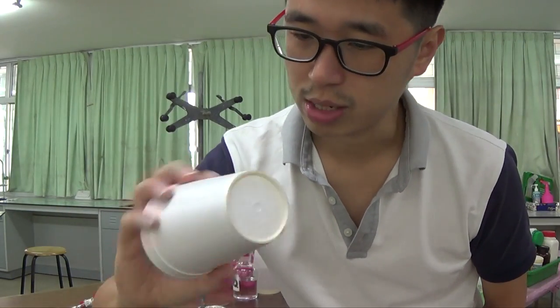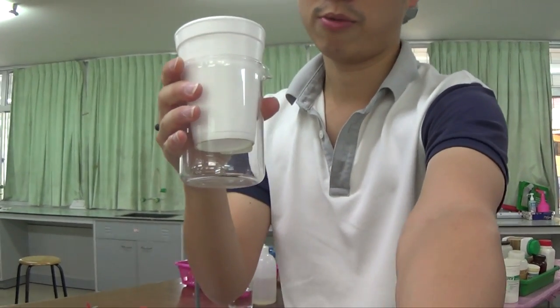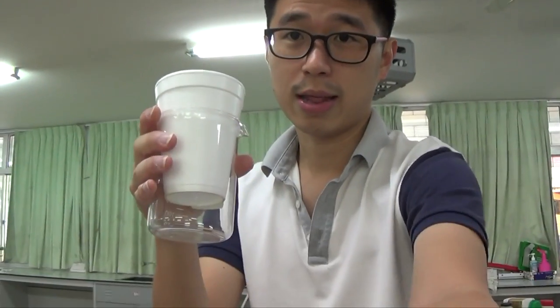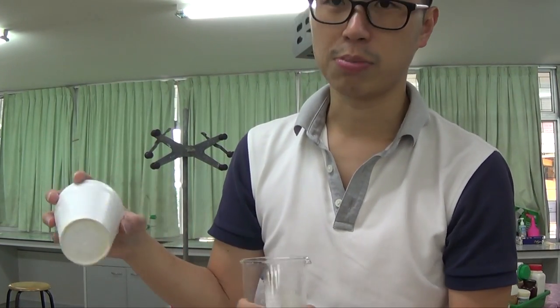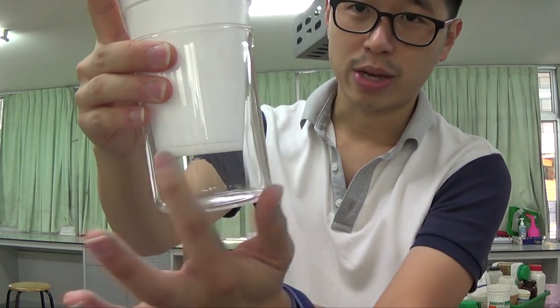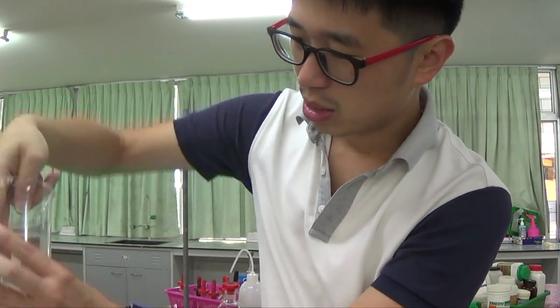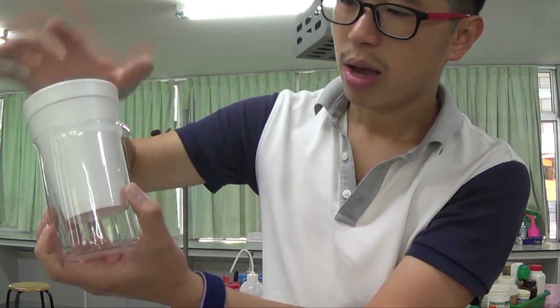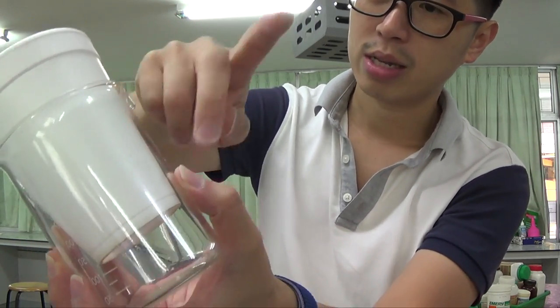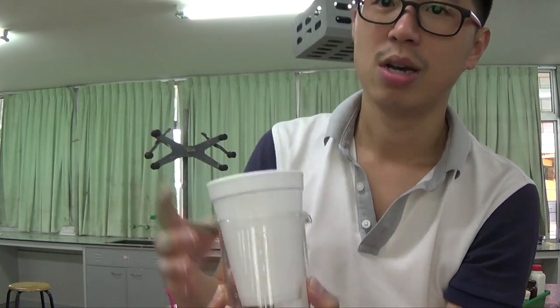Because it is a poor conductor of heat, it doesn't allow the heat to escape from the experiment. Therefore, your heat loss is minimized. Of course, you see there's a little bit of gap inside the glass beaker. So one suggestion would have been to cover the bottom bit with cotton wool, and cotton wool is an insulation between the styrofoam cup inside and the beaker outside. So a bit of cotton wool inside will provide further insulation.